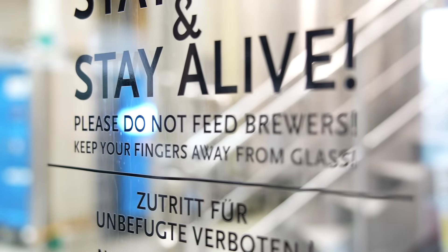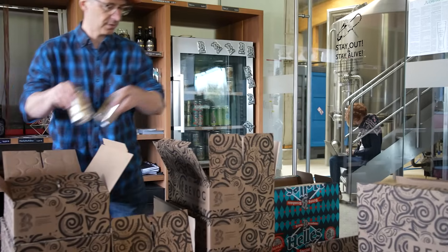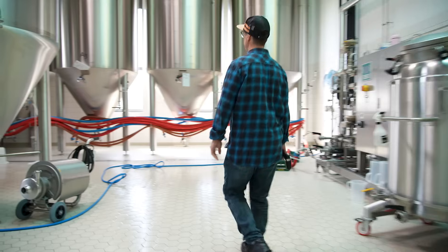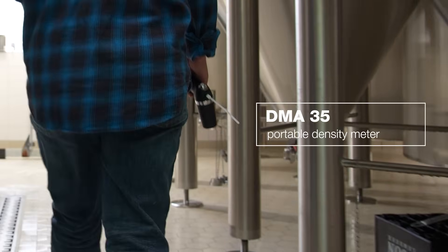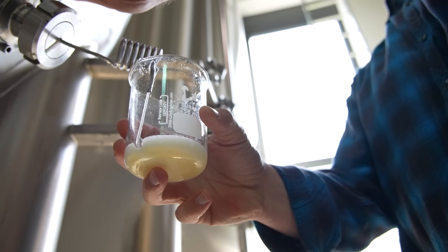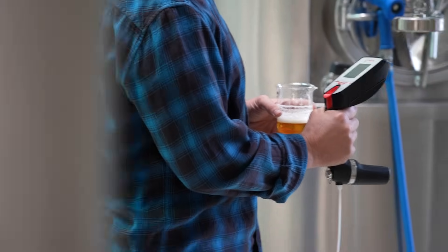Every beer is as unique as its brewer — whether it's consistency for your most successful recipes or the freedom to make a new beer every day. The DMA 35, Anton Paar's portable density meter, gives you the accuracy of a lab instrument while on the go. Get your results with only two milliliters of sample and see your values in a range of units.